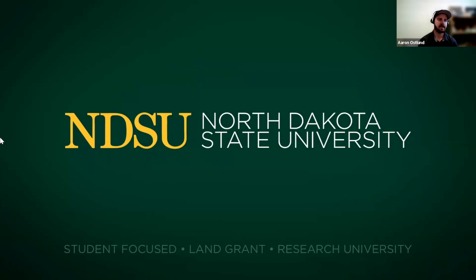So we, through collaboration with stakeholders and working with our Reclamation Advisory Group, have had a couple questions pop up that really got this whole discussion around PID workshop started. And that is, for many of the practitioners, what we're looking at utilizing the PID for is delineation of hydrocarbons within soil matrices. And so the general practice for utilizing the PID for detecting contamination within soil is the headspace development techniques.